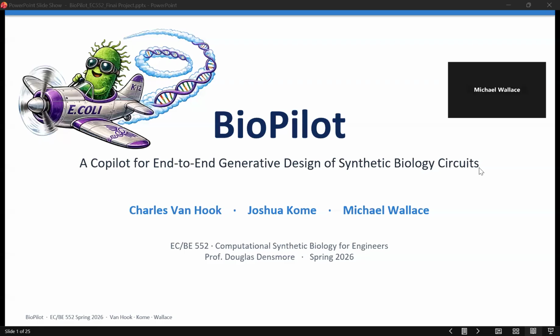Right. Today I'll be presenting on behalf of the BioPilot group. I'm Mike. Other members are Josh and Charles. BioPilot is a co-pilot tool for end-to-end generative design of synthetic biology circuits. We've built this into the existing Knox code base, and I'll go through the overall technical view and a short demo here.